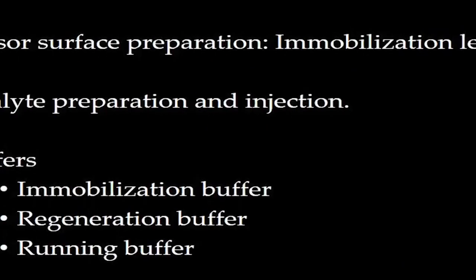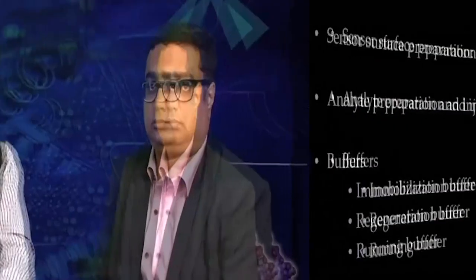In today's lecture, Dr. Srinivas from GE Healthcare will talk to us and highlight the importance of some of these parameters, including the sensor surface preparation, immobilization levels, analyte preparation and injection. Welcome back, Dr. Srinivas. Today we are going to talk SPR assays and different criteria which one needs to take care of during these experiments.